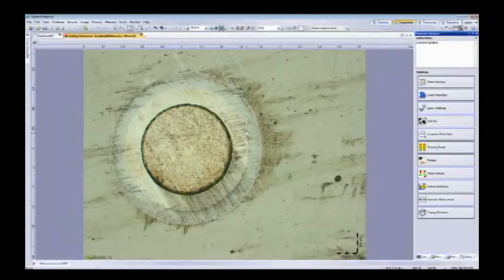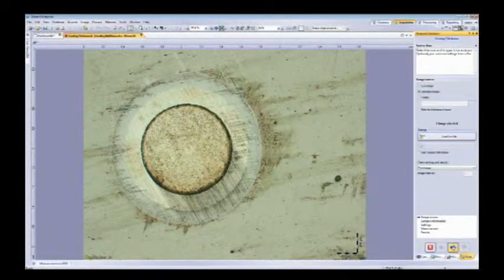Yeah, the coating thickness. I have an image here, real quick. I'll load. So this is an example of a surface that's been used a grinding ball of a certain diameter, grinds through the coatings. And this one has 2 individual coatings you can see here with the bands. We can measure this thickness since we know the exact diameter of the grinding ball and how many coatings we have. So we'll go into that module. So I can see there's like an outer ring that's kind of a lightish gray color, and then an inner ring, and then you've got the actual base material.